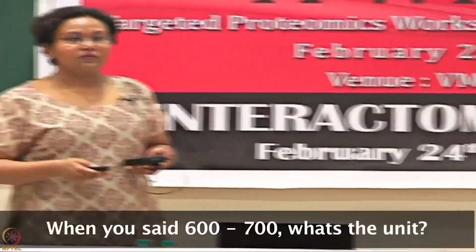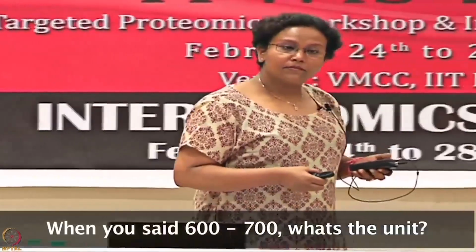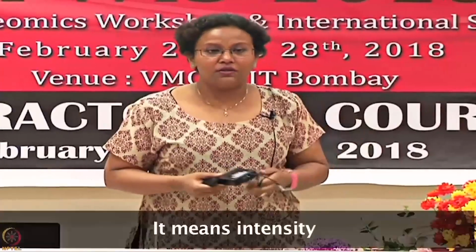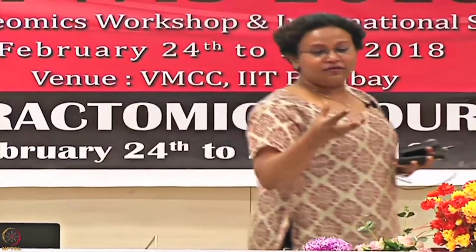I'm a bit confused. When you say 600, 700, what's the unit? RUs, resonance unit, response unit. Yes, exactly. Like I said, it is related to the refractive index. The change in mass will change the refractive index, and that is related to your response unit.